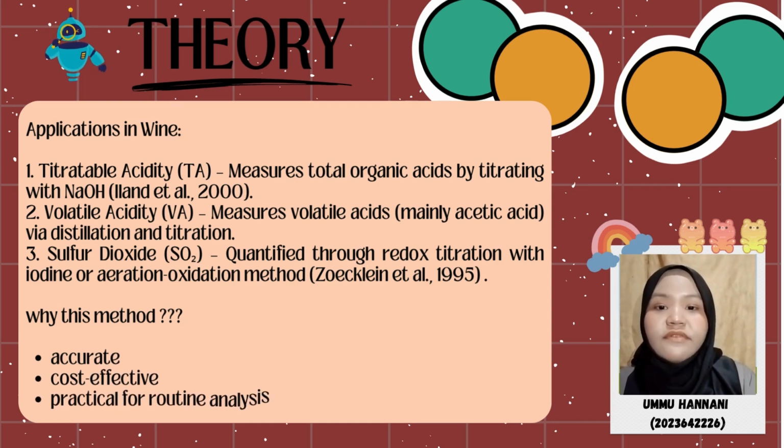And the third one, we have sulfur dioxide. Sulfur dioxide helps preserve the wine and prevents spoilage. We measure it using a redox titration with iodine or a method called aeration oxidation.